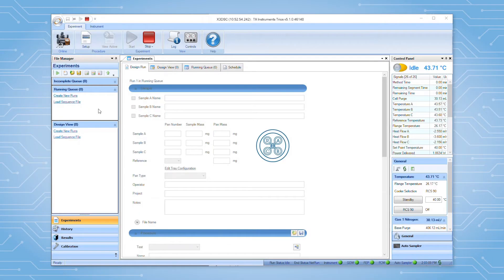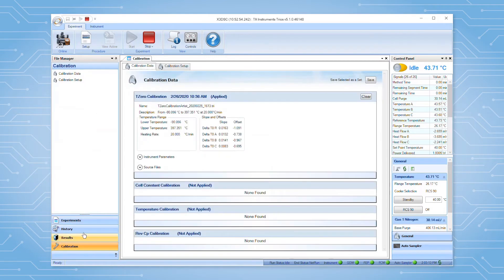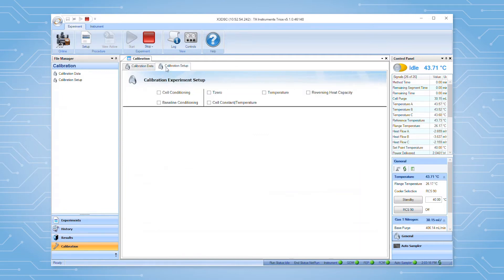To set up the calibration routine in TRIOS, first display the calibration page by clicking the calibration button in the file manager, then select the calibration setup tab.